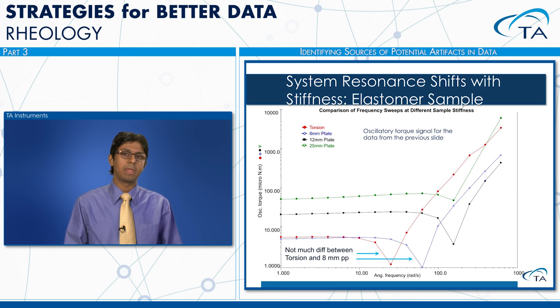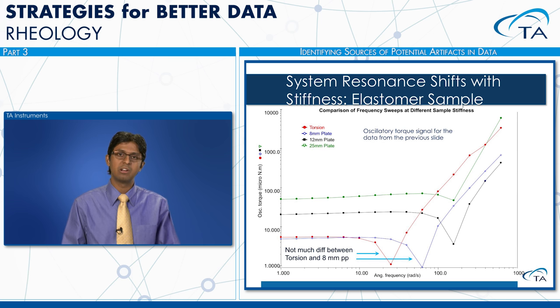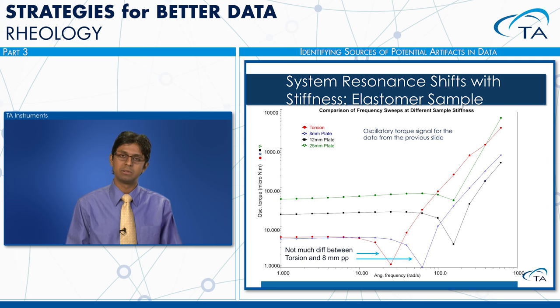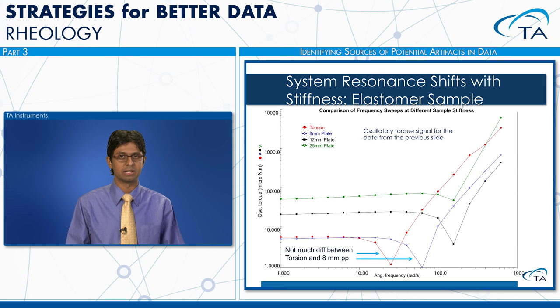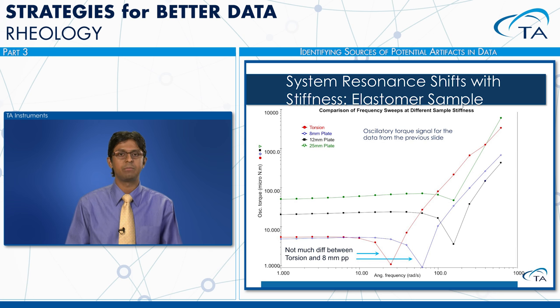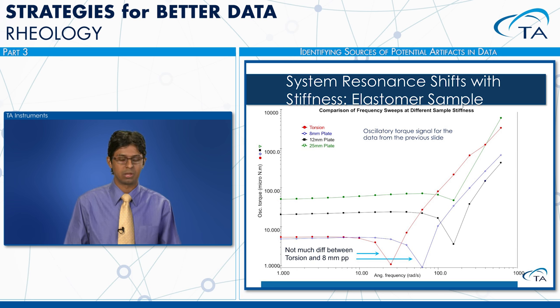Looking at oscillation torque for the same data, there is a sudden drop attributable to system resonance — the point at which we hit the sample's resonance frequency during testing. The best way to address this is to change the sample stiffness by changing the geometry. Between the 8 mm parallel plate and torsion rectangle there is little difference, but stepping up to the 25 mm parallel plate shifts the resonance frequency toward the upper end of the test range.